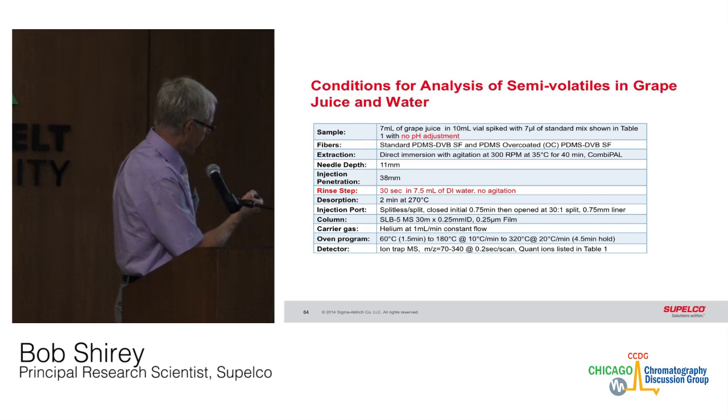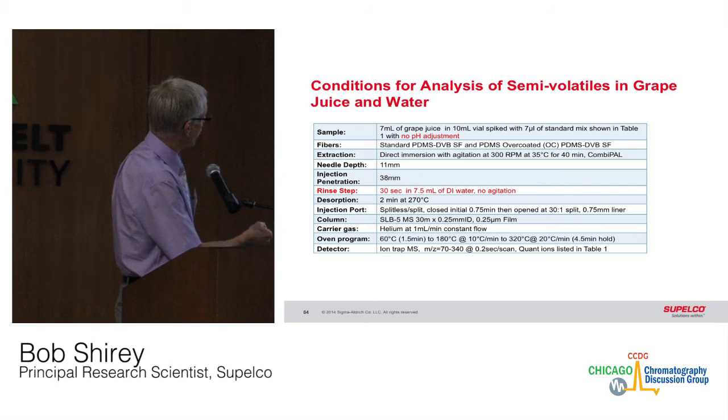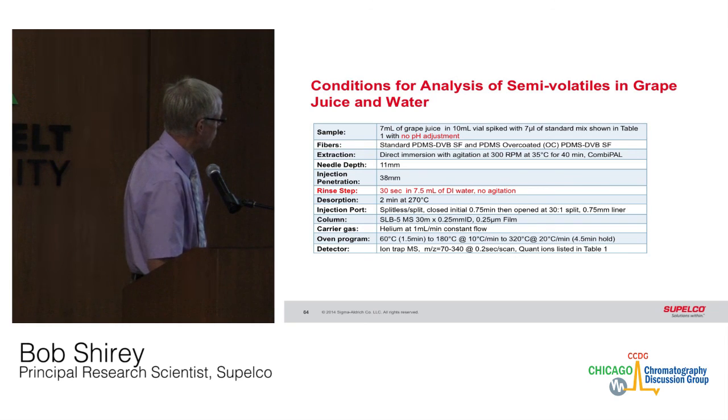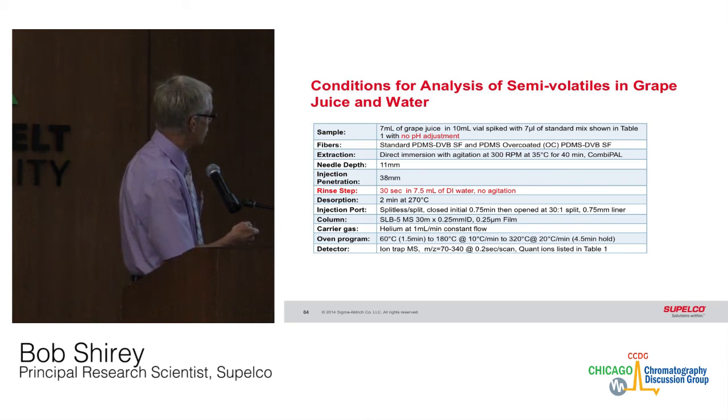Then after extraction, you want to rinse the fiber in water. Now we did all this using the autosamplers, which is really essential for this type of work. And then we did a desorption. In this case, we didn't do a post-rinse, but in some later applications, we did do another post-cleaning of the fiber after desorption.